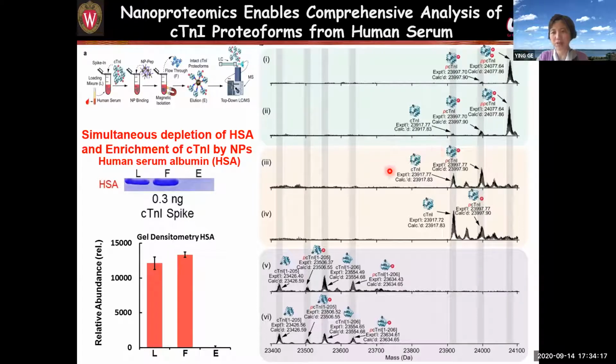Okay, we are really excited about this result because, as you know, detecting proteins from blood is almost like a nightmare. So we are able to see the molecular signature that could potentially differentiate the patients into different subgroups for better treatment.